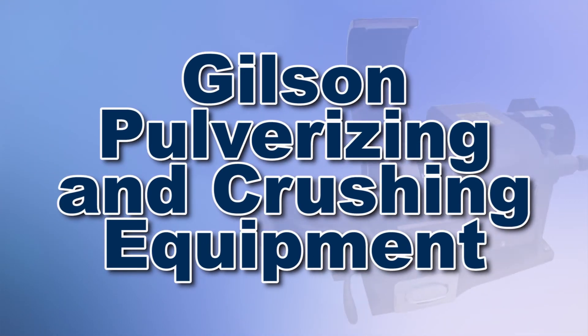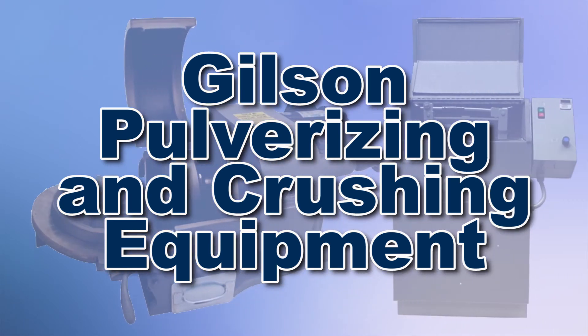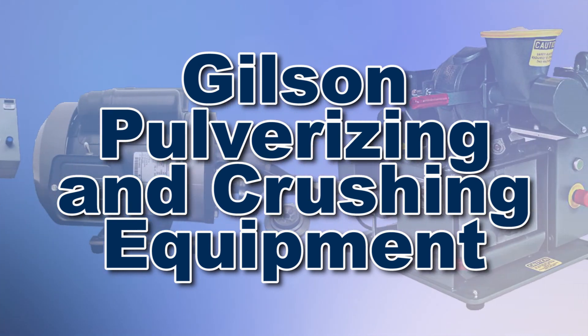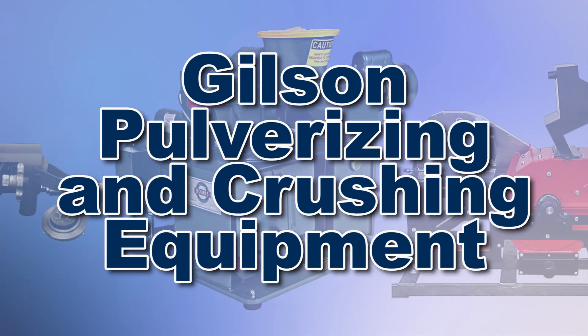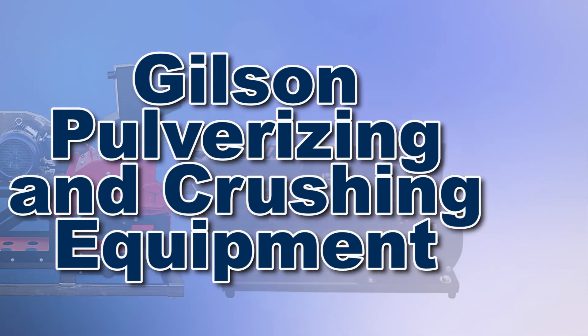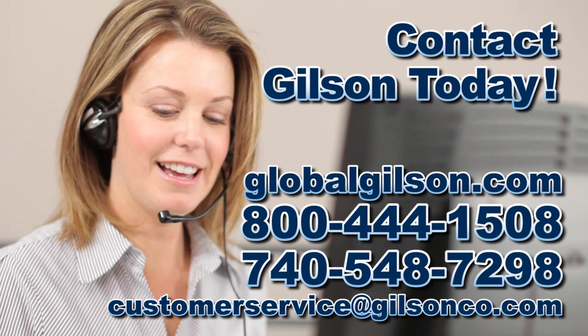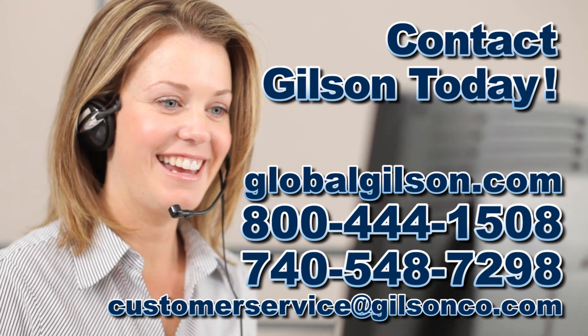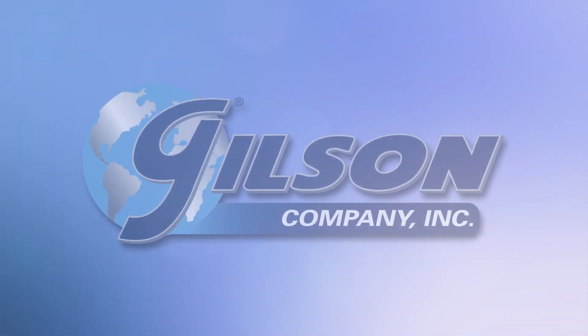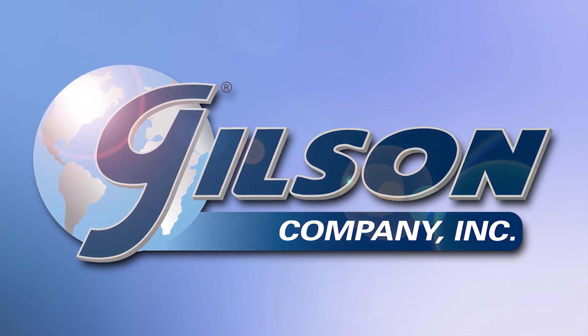With Gilson's complete family of pulverizing and crushing equipment offering a wide range of performance features and capacities, Gilson has the right equipment to fit your needs for fast and reliable material crushing. Be sure to check out all our products listed in the Gilson catalog and on the Gilson website. Gilson — your industry leader in materials testing equipment.